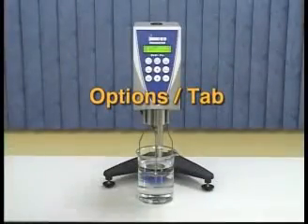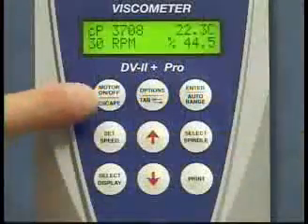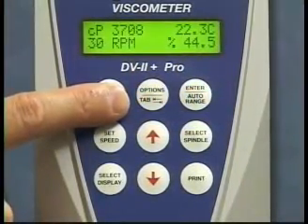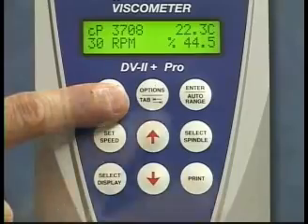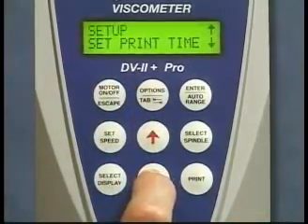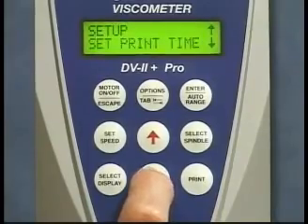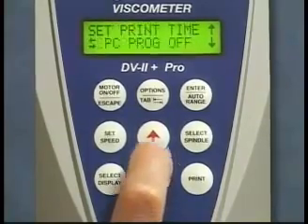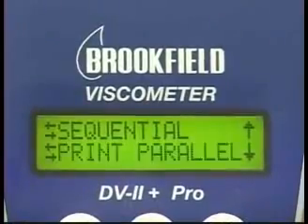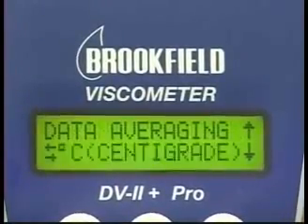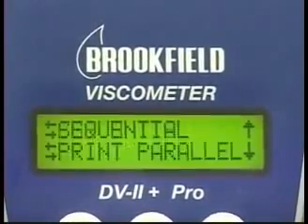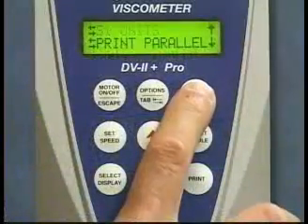Options tab. By pressing the options tab key, the user will access the options menu of the instrument. Once in the options menu, the user can select the appropriate option or parameter by using the arrow keys or the tab key. Once the user has selected the specific setup parameter they wish to use, press the enter auto range key to accept this parameter.